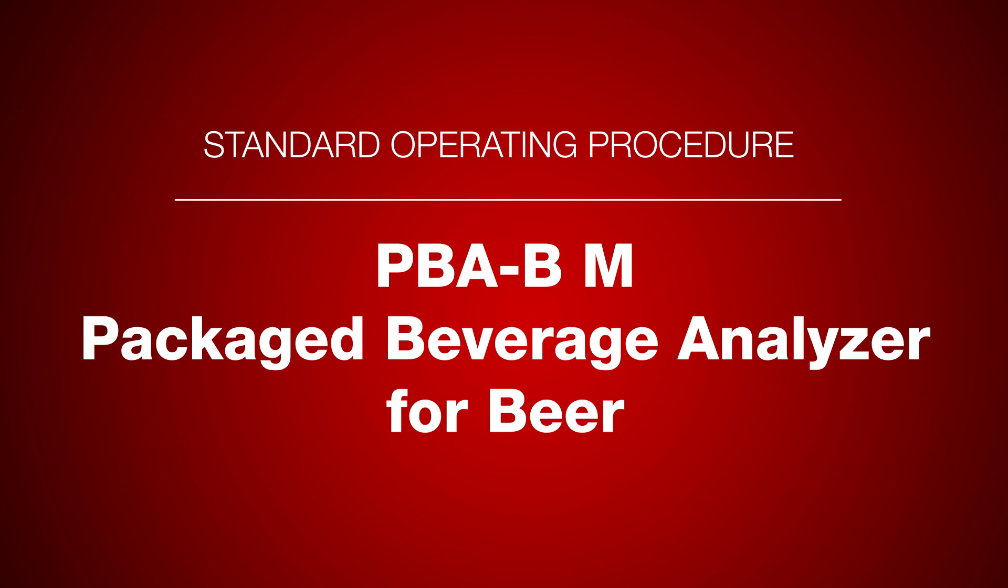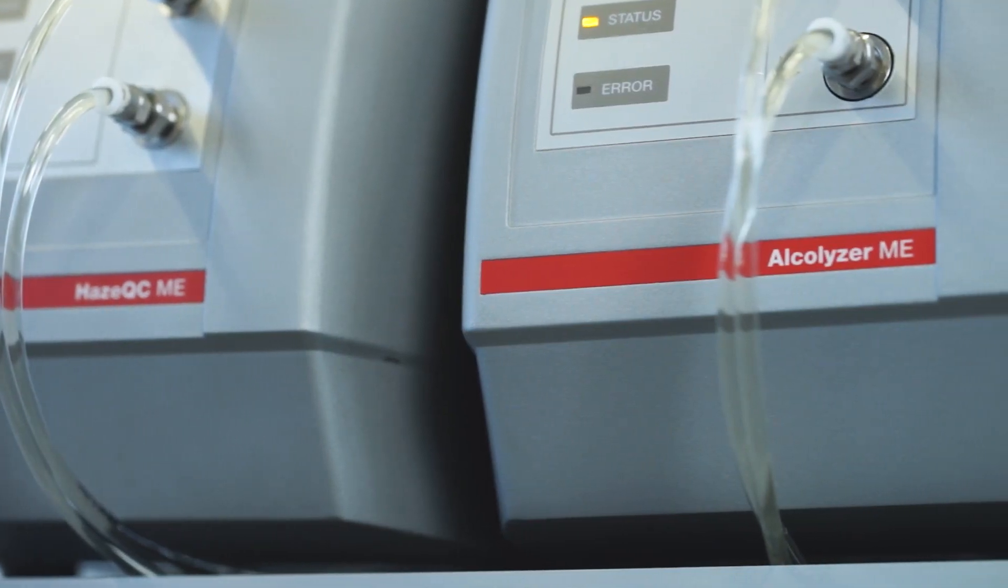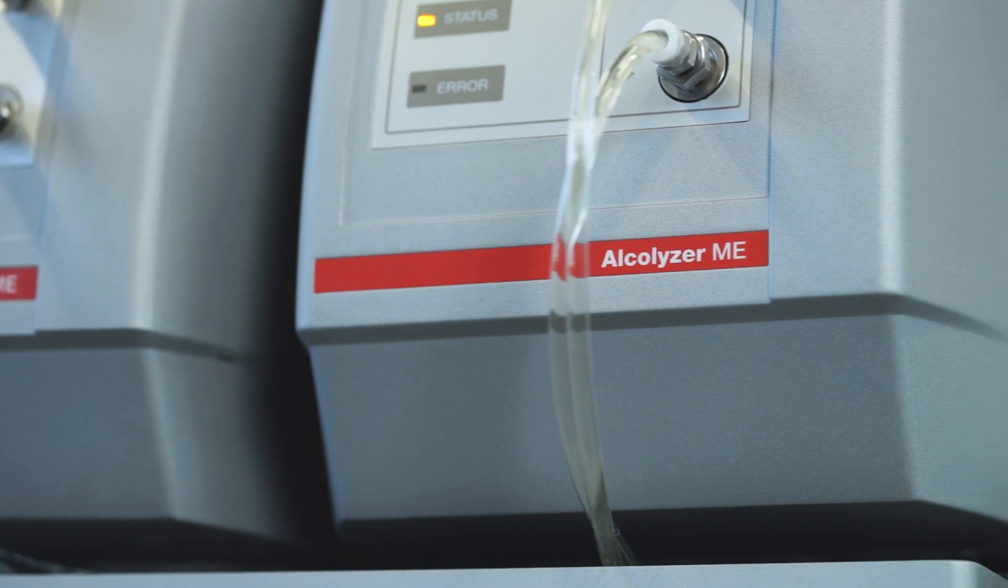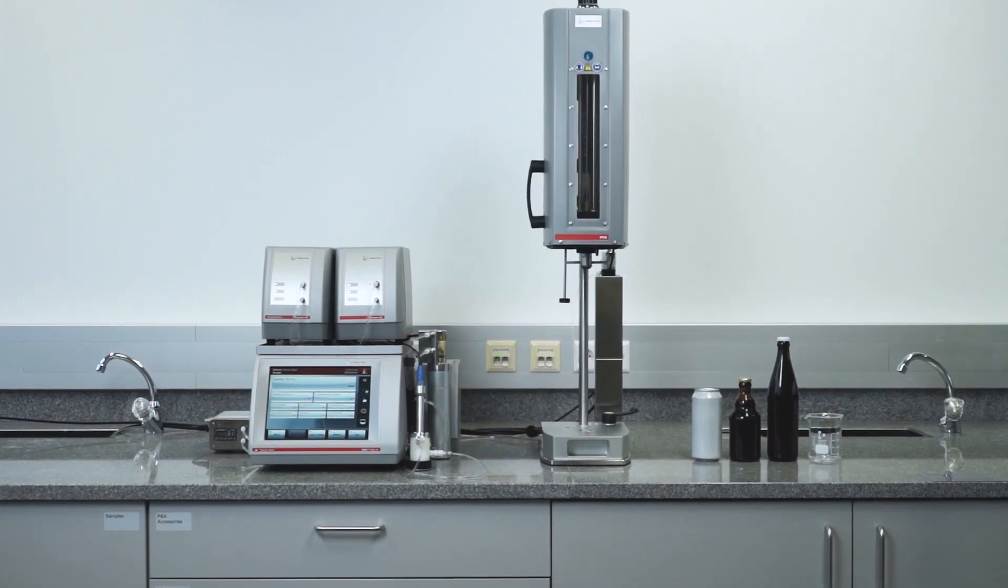The PBA-B system is the ideal solution for the final quality control of bottled beverages directly out of glass bottles or cans. All measured parameters are determined simultaneously without prior sample preparation.